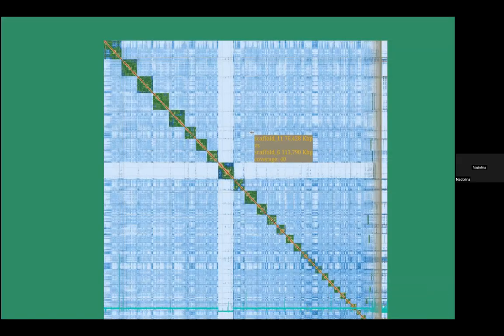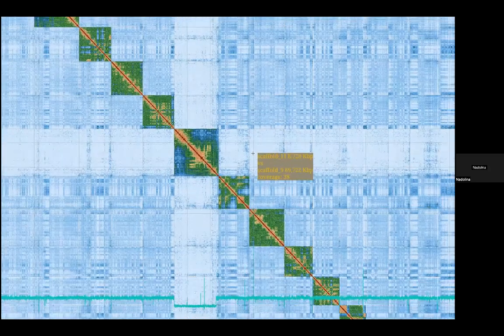It starts off down here. And I'll zoom in a little bit more, but not too far, because I want you to see the contrast. You can see that it dips here. There's no scale on the side, which would be great. It's just not here. But you can see that it dips by about half, right? And so that's a really good indication that this is one of our sex chromosomes and probably the X chromosome.